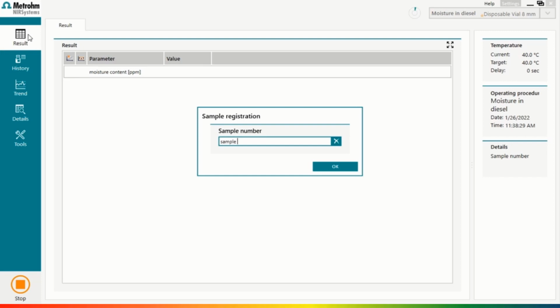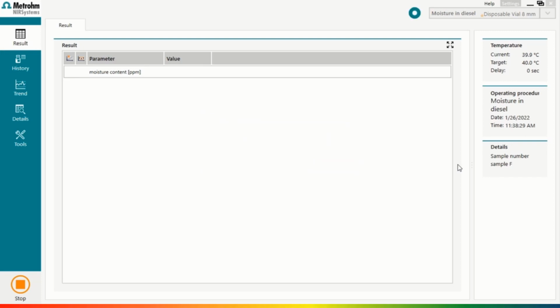Now, you know the basics behind NIR spectroscopy. But how do you get results from the measurement? For this, a mathematical model, called a prediction model, is created. To create such a prediction model, we need the absorption spectra of our sample on the one hand and a reference value on the other. For our moisture example, we can use Karl Fischer titration to get the reference values. Whenever an unknown sample is measured, the model predicts the content of interest, in our example moisture.